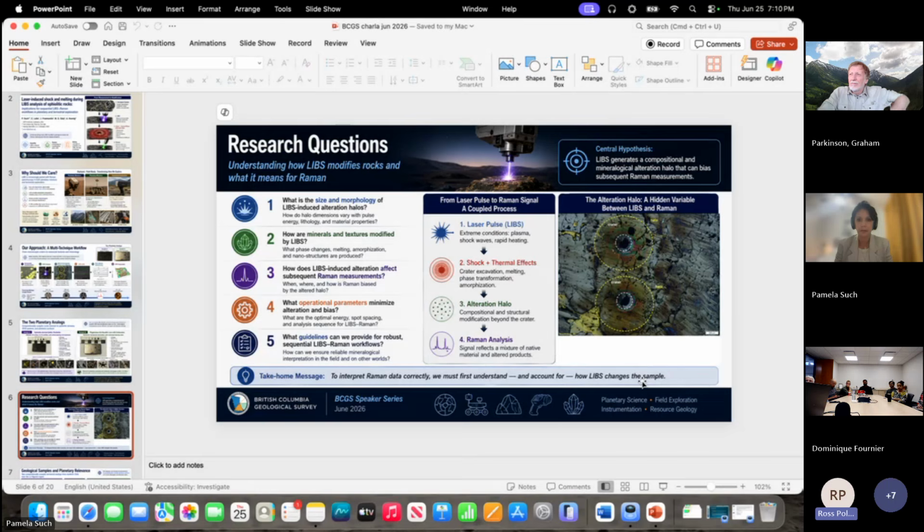Kind of. I was thinking more about special considerations in the data, like the instrument getting dirty all the time and contaminating it, or whether it works more easily in space because there's no atmosphere. Well, it depends where you are. Mars is a problem because there are winds and there's powder everywhere. And then you cannot clean the area now with LIBS because we would be changing the composition.